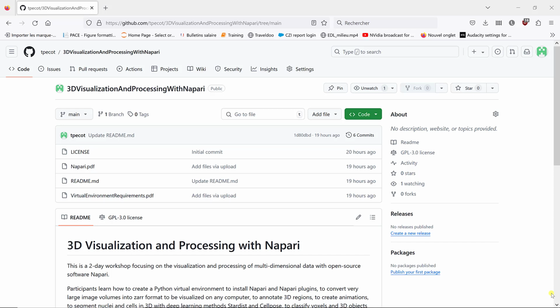And then this environment, as long as you don't modify it, is going to keep working and running as long as it's installed, and it won't change. So if you install exactly what you need, then this will run forever. That's very important. And if you need a new project with different versions, then you create a new virtual environment.